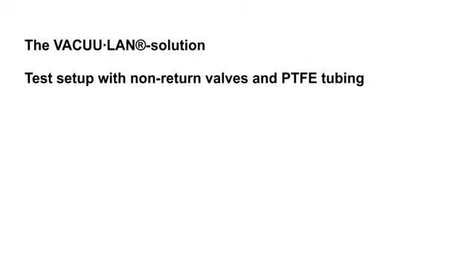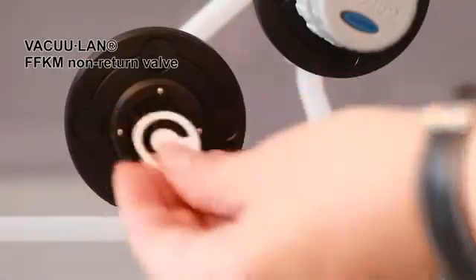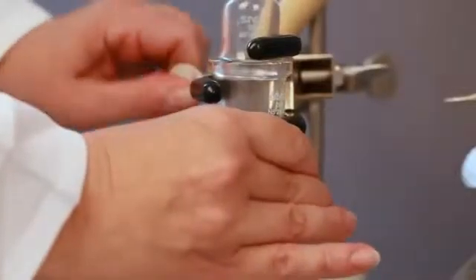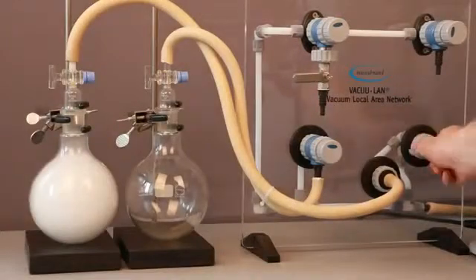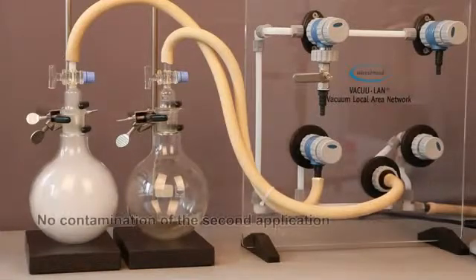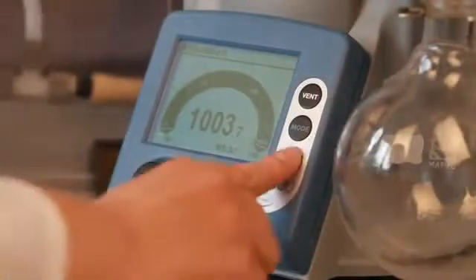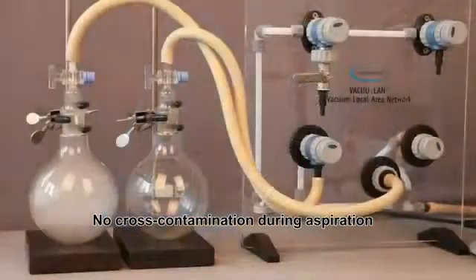The VacuLan solution. The same test setup again, but this time with PTFE pipe tubing and VacuLan modules with non-return valves. Again, a smoke-filled flask is brought into the vacuum system. The VacuLan valve is opened. The non-return valve prevents the contamination of the second flask. Also, there's no cross-contamination during aspiration.